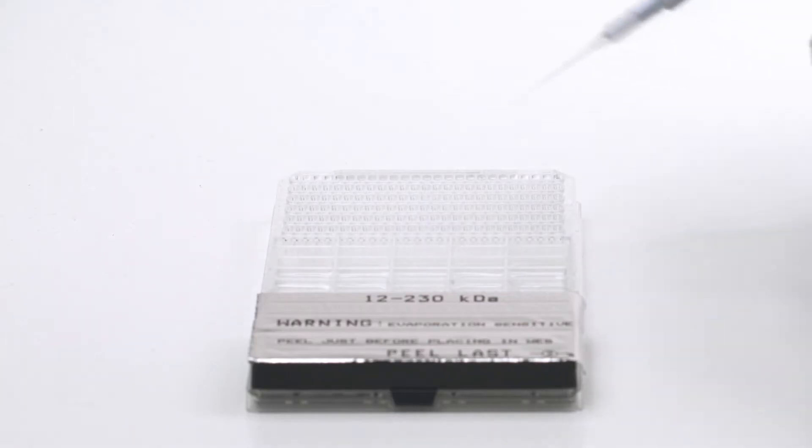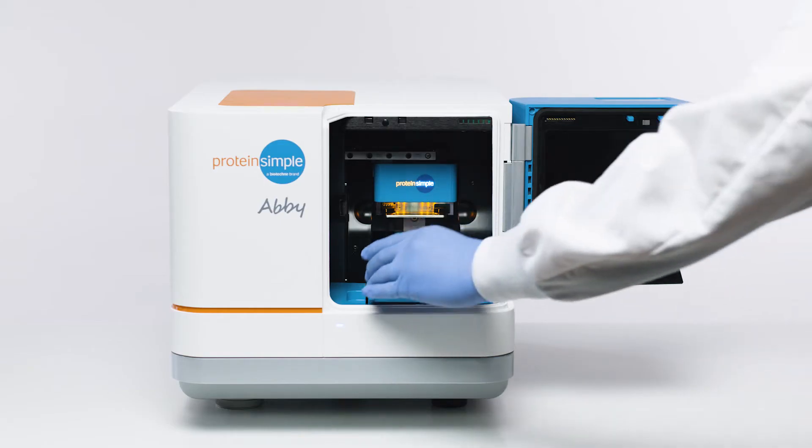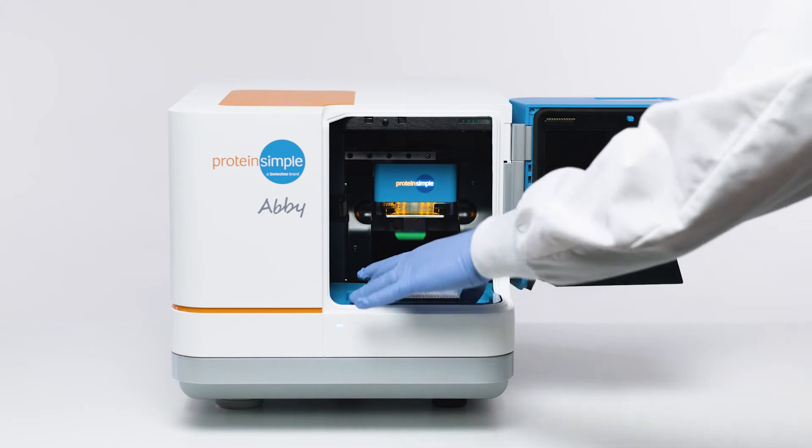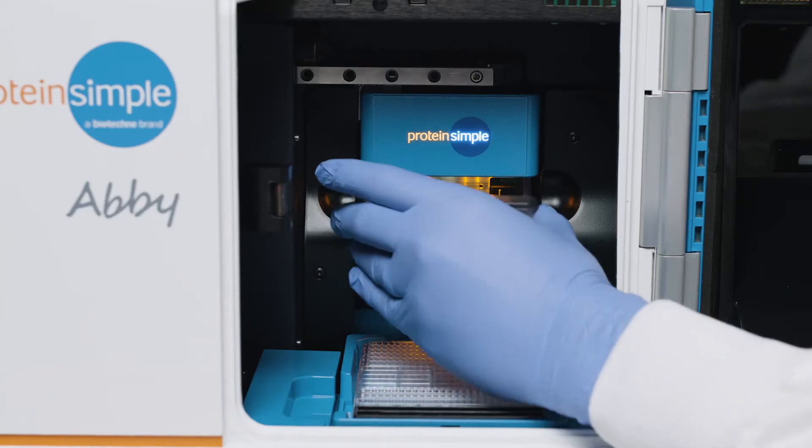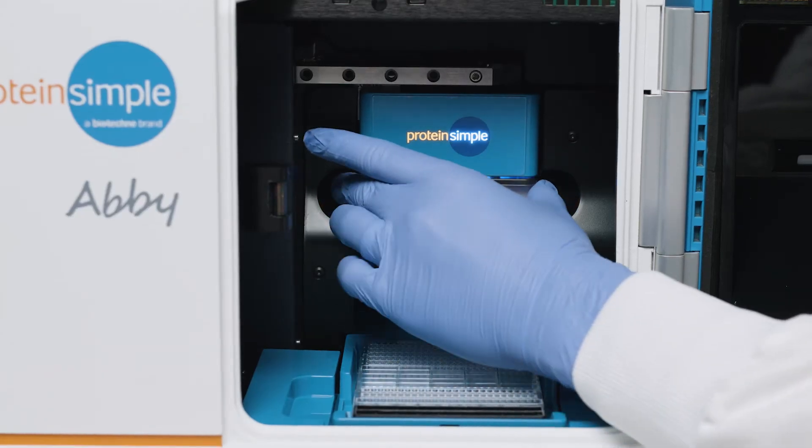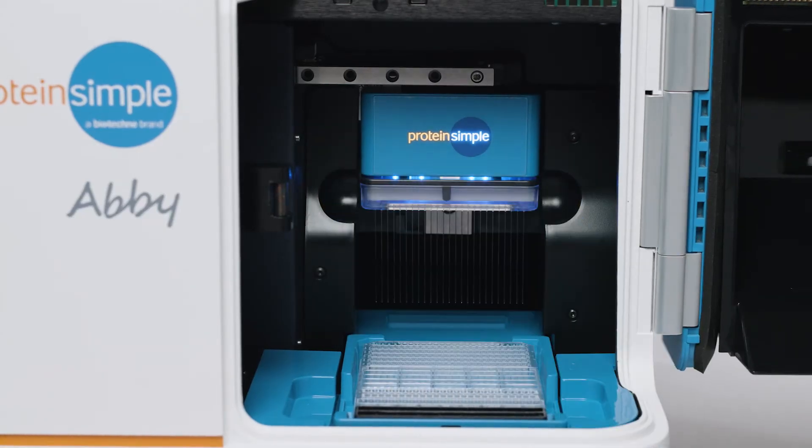Just load your samples and reagents into the microplate, insert the plate and a capillary cartridge, and Abby does the rest.